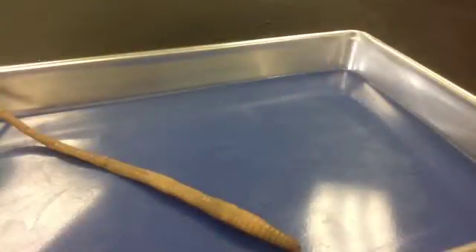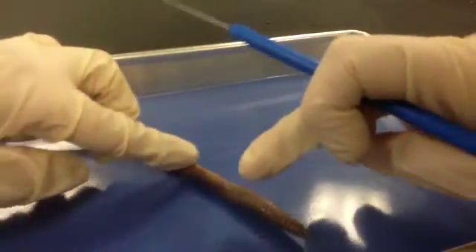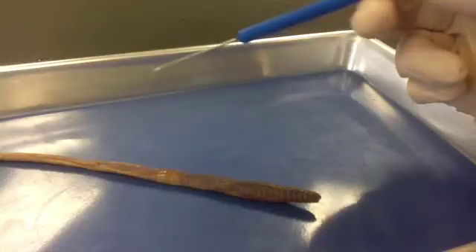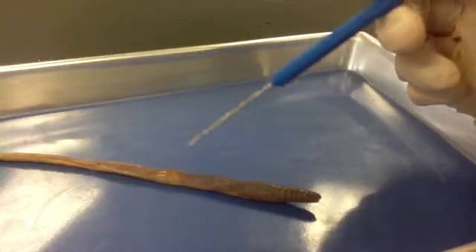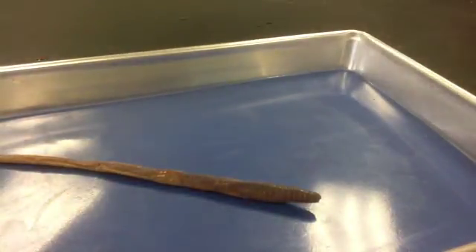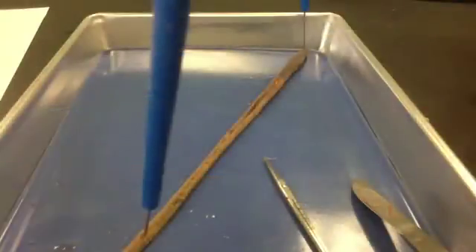Now we're going to look at our interior organs. Turn the worm dorsal side up, so the dark side is facing up. We're going to be cutting at the posterior end along the dorsal surface, from here going this way. It's important that you start at the posterior end because what's down there is just intestine — nothing really critical. Everything like our esophagus, our crop, is going to be up here by the anterior end, so we want to start well below the clitellum.